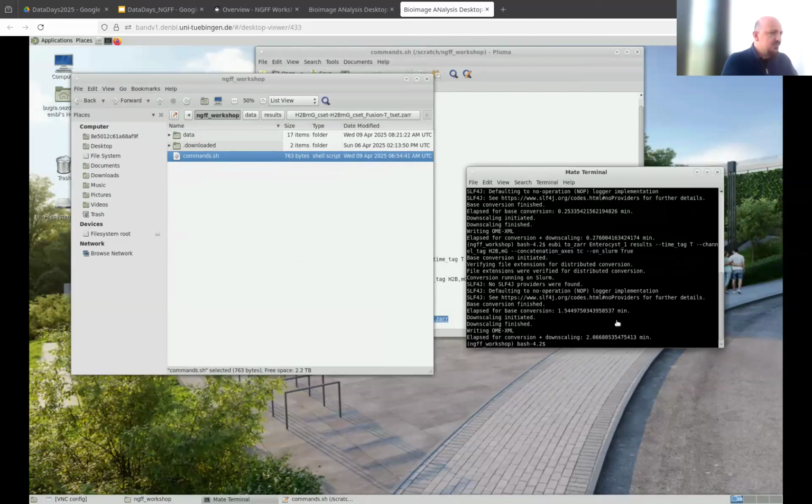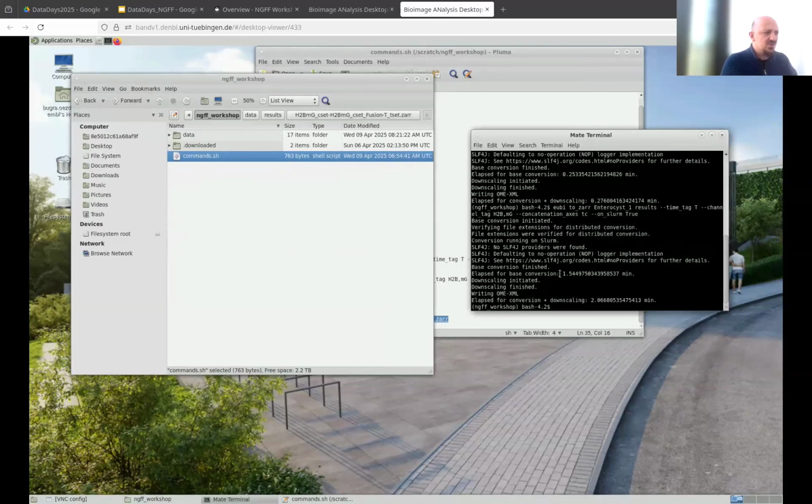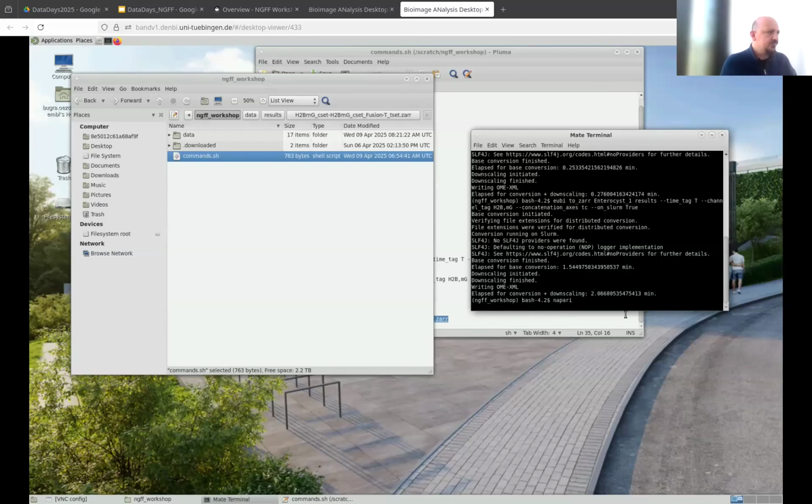This is actually pretty simple, and you also have a Napari here, by the way, but for this case, I think I found it's a bit faster when you use the Napari from this Conda environment. Maybe it's a version issue. So I will use the Napari from our own Conda environment. You can simply type napari.